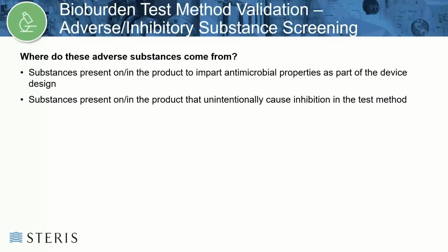Upfront notification of information on known adverse substances will allow the test lab to carry out trial work and build neutralization into the proposed test methods in advance of beginning the method validations. Sharing this information with the test lab along with safety data sheets will ensure that the appropriate safety and disposal processes are considered as part of initial product and method review.